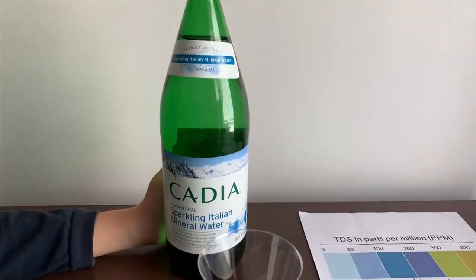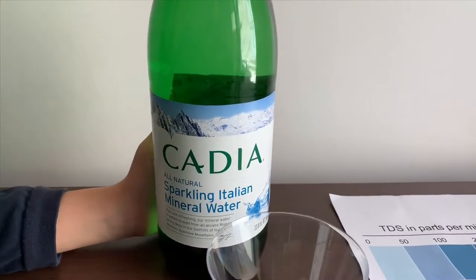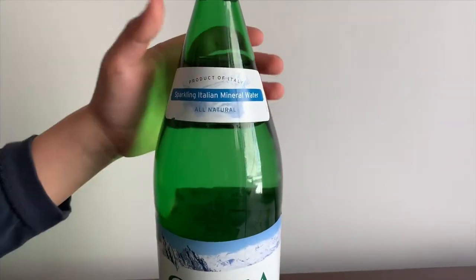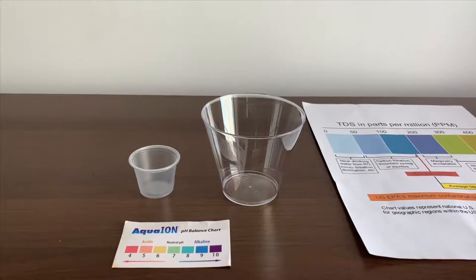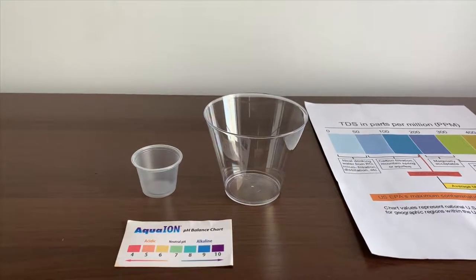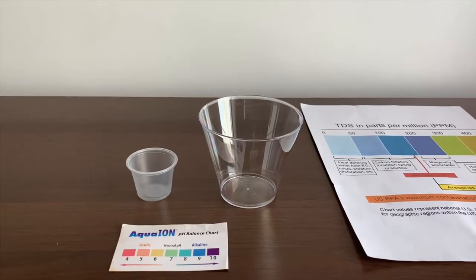This is Cadia Sparkling Italian Mineral Water and costs $2.49. Let's test the pH and TDS levels. Let's pour some water in.